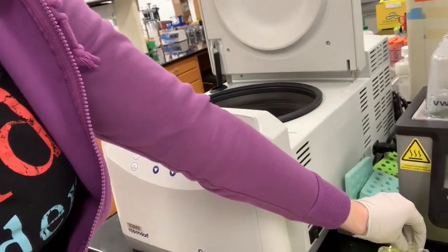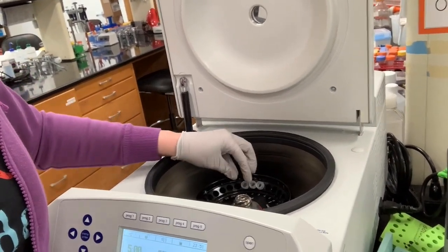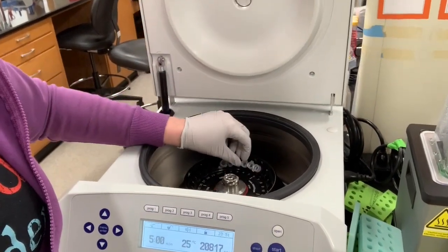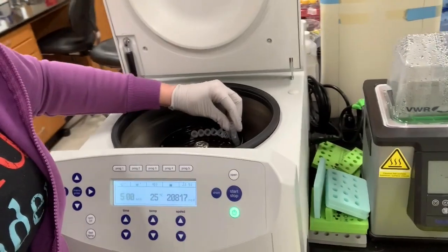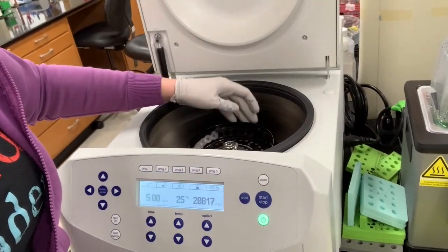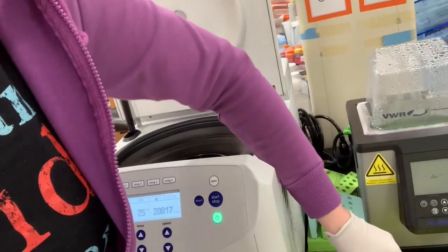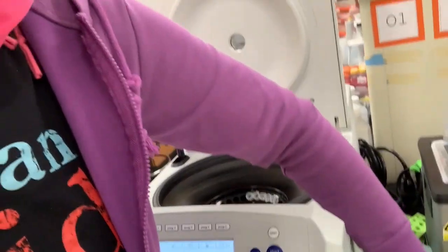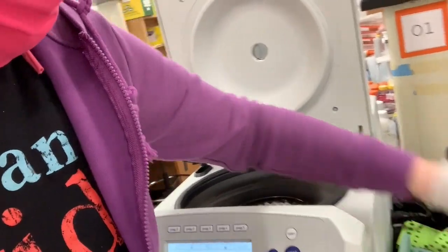So then you're going to put your samples into the centrifuge. If you haven't used a centrifuge before, you want to make sure that the samples are balanced. So that means having the same number of samples on each side. If you just put all of these samples on one side, it wouldn't be balanced, and it could end up breaking the rotor eventually, or breaking the centrifuge. So remember, this is going to spin, and it needs to be balanced when it does so. That's true of all centrifuges.